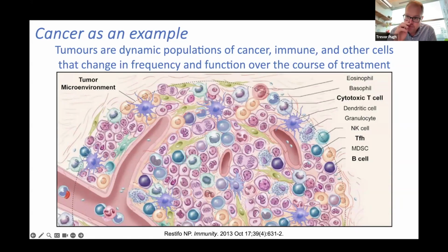When they do the barcoding, have you heard about the percentage capture at the cellular level? Because normally with 10x Genomics, you can only capture about 20 to 30% of the cells. You go much deeper with Parse. Definitely the sensitivity is greater. It's a targeted sequencing approach. It is highly dependent on the quality of your sample, so it's very hard for me to say it's 1 in a million or 100,000.